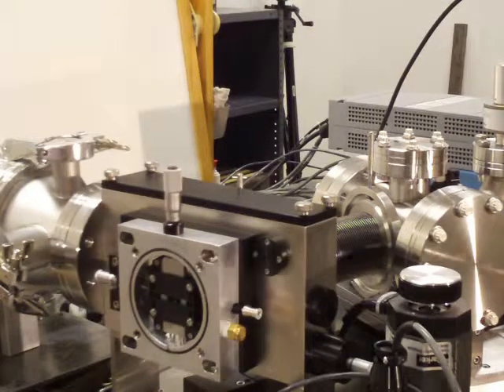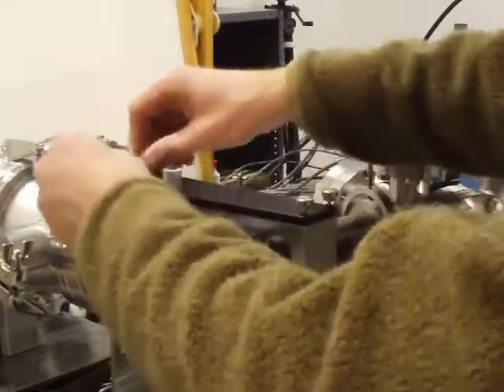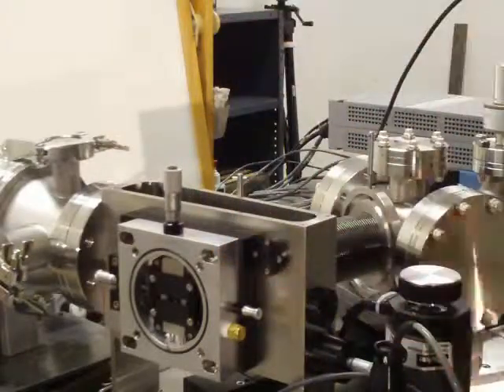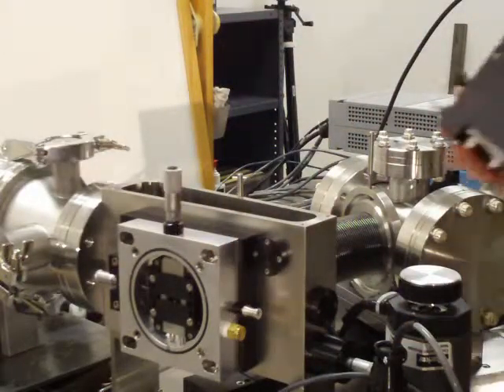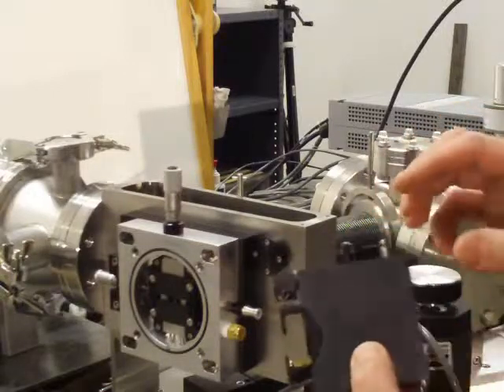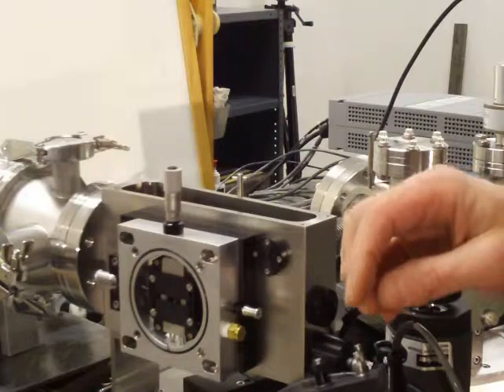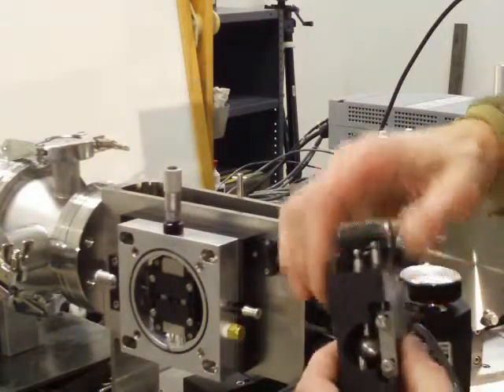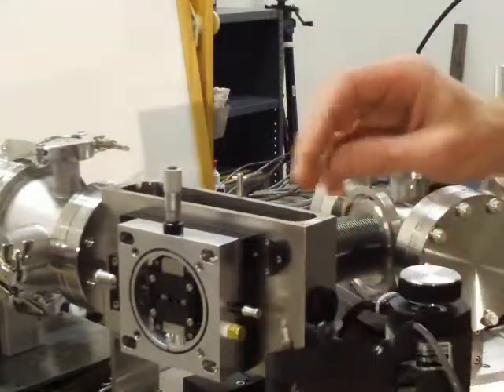As said, the diffraction gratings are easy to install. You remove the top cover of the instrument — four screws — and set it aside. The diffraction grating holders all look like these heavy blocks. The grating is in the front. There are several adjustment points on these gratings which are all set at the factory and need no user intervention.